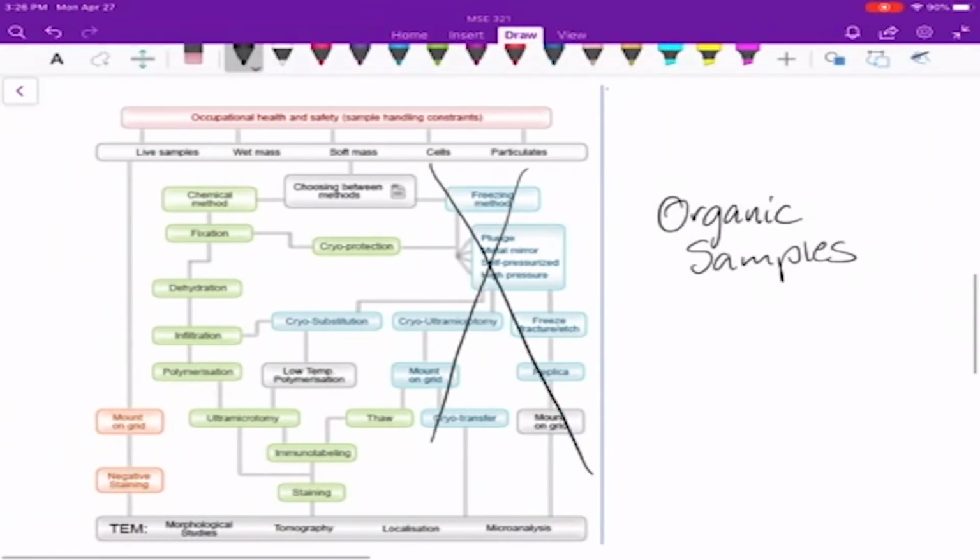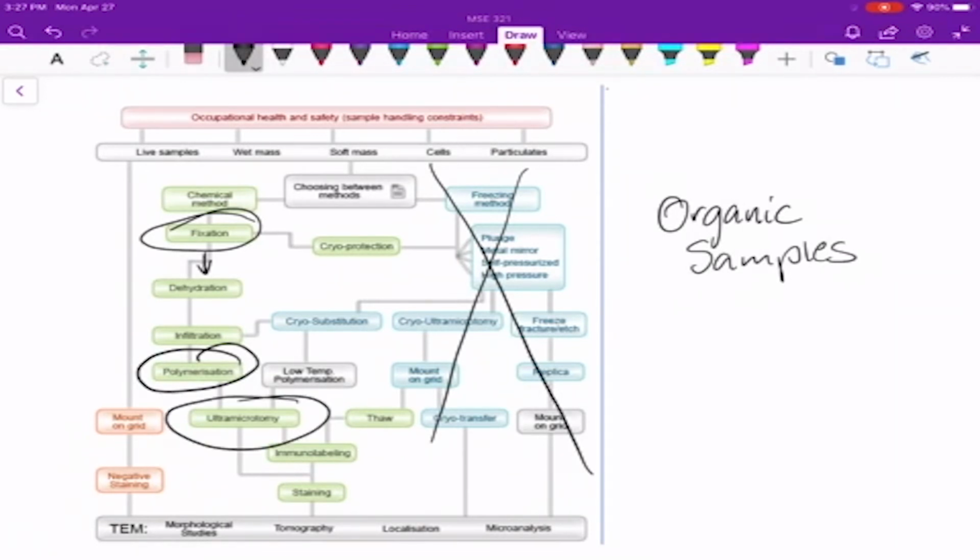Fixation is done by soaking and or washing the sample in different solutions of chemical preservatives, then it's rinsed in distilled water. Next, the sample is dehydrated in stages by soaking in ethanol or acetone solutions. The sample is then embedded in a polymer resin epoxy, cured until polymerization is complete, and then the sample section is cut thin with a microtome. Then that's collected onto a copper support grid and coated with carbon. Now your samples are ready to be examined.